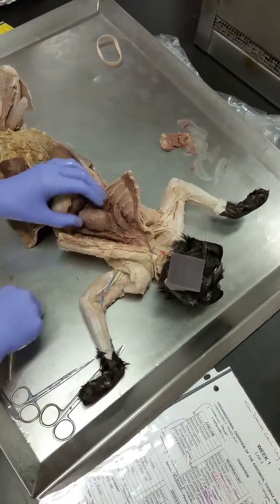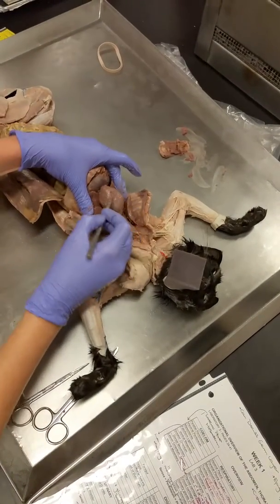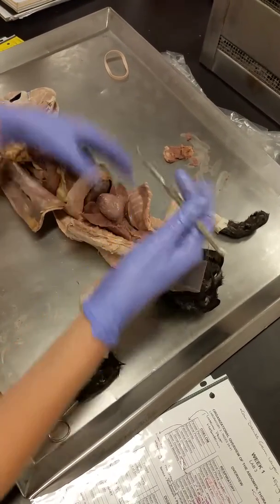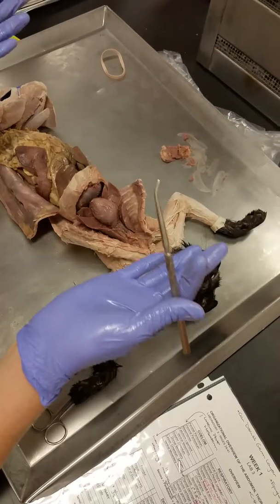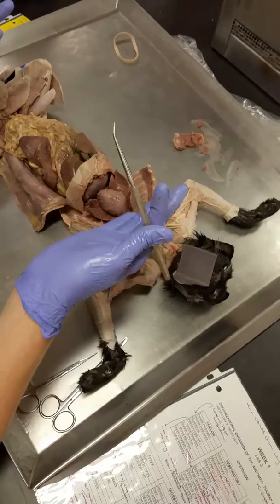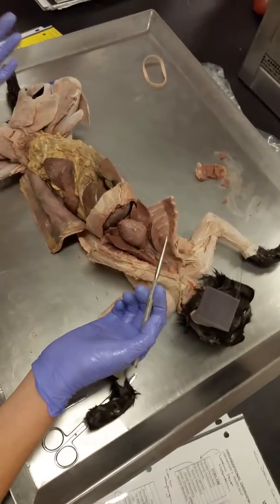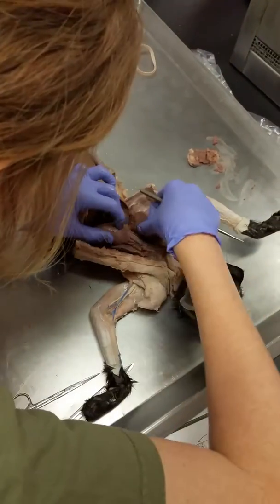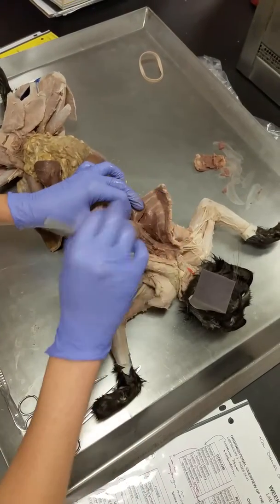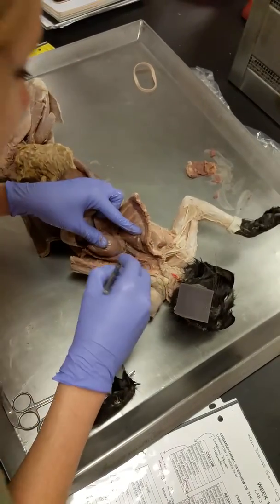There is a nerve that is going to be stuck onto the pericardium. So after I ripped all the fat off, what I'm looking at now is pericardium. And there's going to be a nerve stuck right against the pericardium, and that is the, oh my gosh, phrenic. It's the phrenic nerve. I'm like, it's C3, 4, 5, but I can't remember the name. It's the phrenic nerve. And we want to make sure that we don't damage it. So all of the nerves will look like little pieces of dental floss.